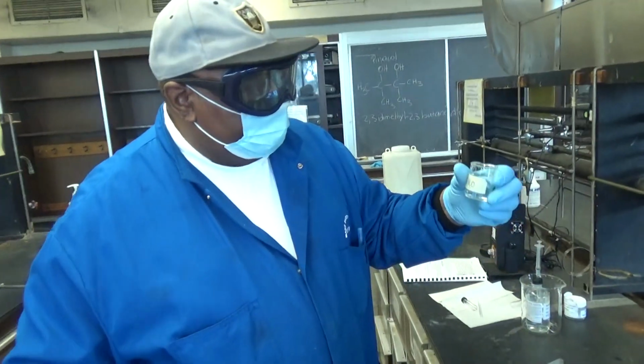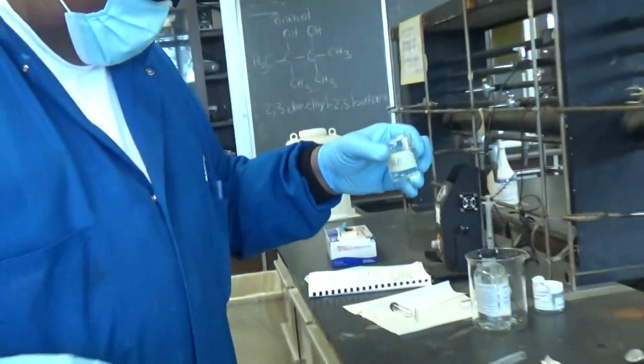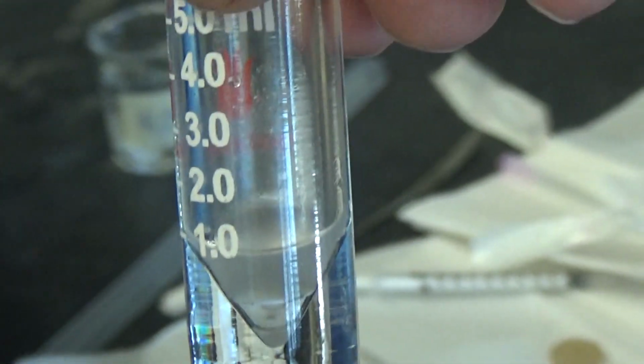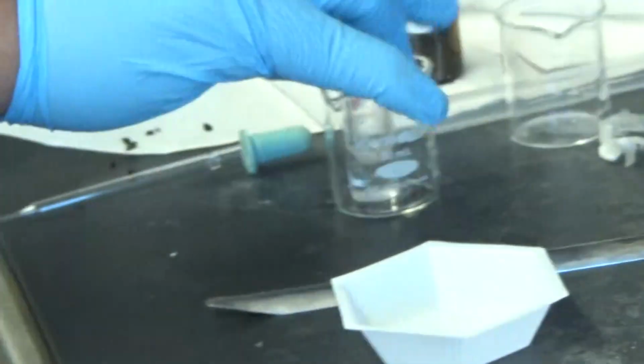So we are going to add 1 milliliter of water, deionized water, already prepared. This little thing is kind of like a mini separatory funnel. A separatory funnel is a nice thing, but it's huge, and they only have a tiny bit of product. So this acts like a way to separate an organic from an aqueous, and it's microscale. The conical vial is like a microscale separatory funnel, just like the separatory funnels they saw in the previous experiments.